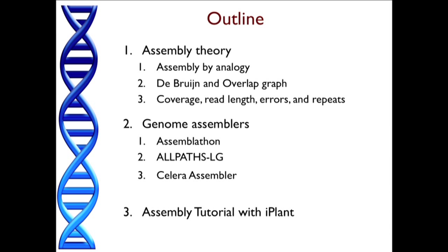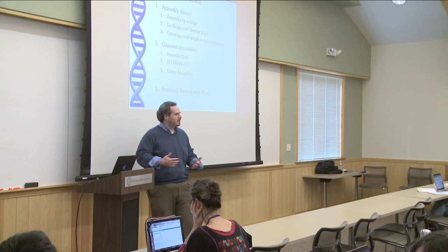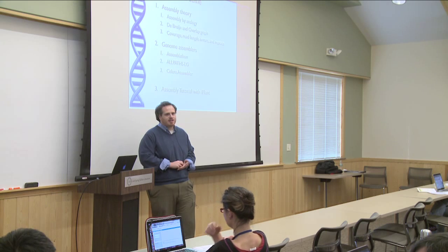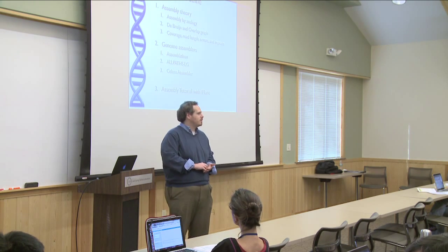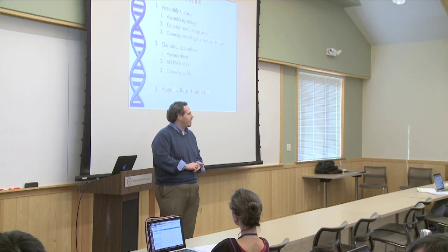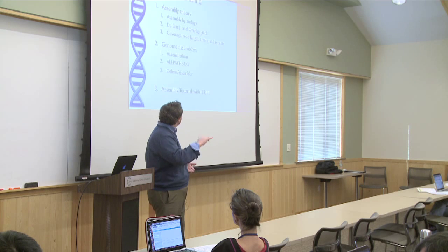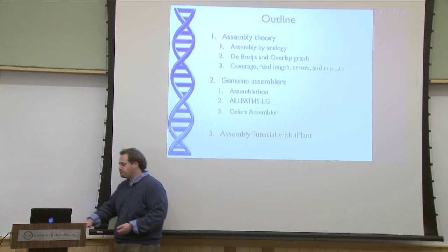Then I'm going to walk through a couple of different assemblers, and talk in a little bit more detail about how they work. I'm also going to talk about this project called the Assemblathon, a big international consortium to evaluate the best assemblers to use for different data types. That gives us a lot of guidance about the state of the art, what the right algorithms are, and what the right tools are that we should be using. At the end, I'll give you this hands-on experience with iPlant. The lecture half will be about 45 minutes, and about 45 minutes hands-on.